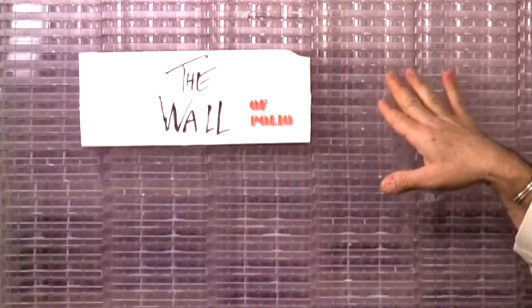In fact, this wall that you see behind me in these videos, I call it the wall of polio, is a stack of 6 well plates that we have used to measure the titer of poliovirus. This wall is made up of 1,464 plates that were used for a single experiment done over the course of 2 weeks. That's how a plaque assay is done.